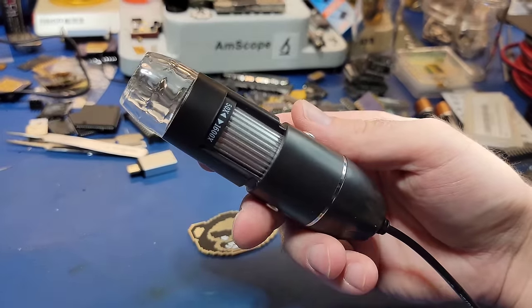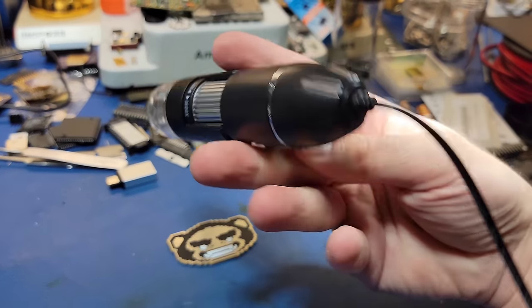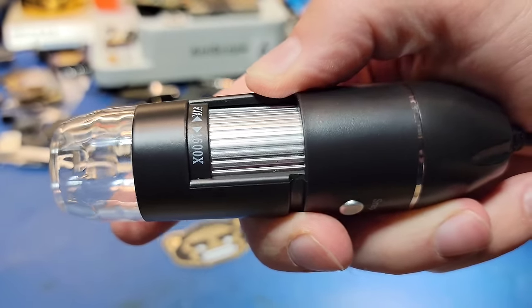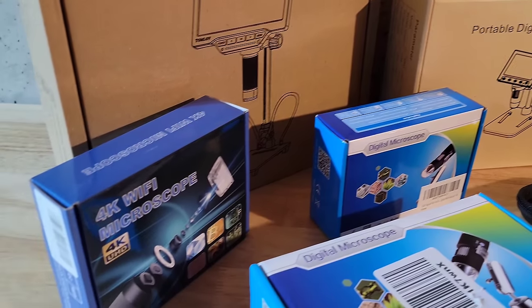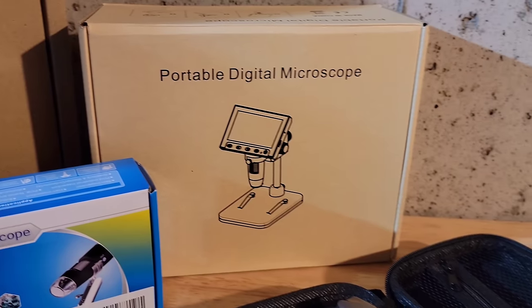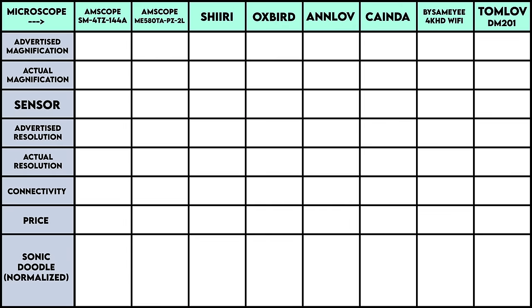If you want to look at silicon chips up close, do not buy this kind of microscope. There are many digital microscopes like this and they will all leave you severely disappointed. In this video I'm going to do a deep dive on six different digital microscopes that I got from Amazon and compare them to my two optical microscopes. I tried to pick a varied set with a wide range of features and specifications — some have screens, some are high definition, and some advertise up to 2000 times magnification. As I go along I'll be filling out a table with all the specifications, and the full table will be at the end of the video.